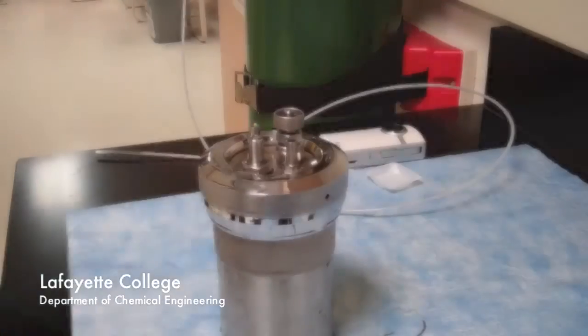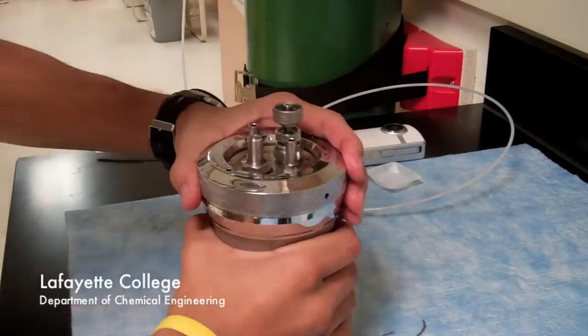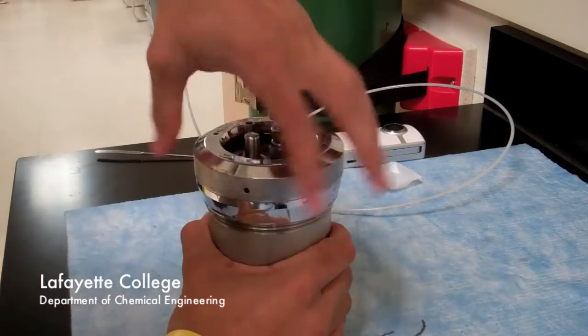Remove the bomb from the calorimeter. Depressurize the bomb by opening the gas release valve slowly. Allow all of the oxygen to escape the bomb.